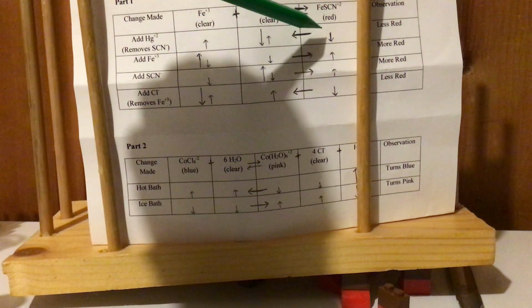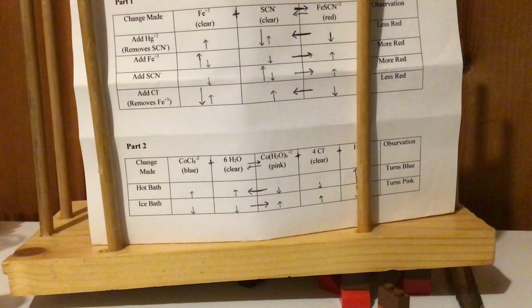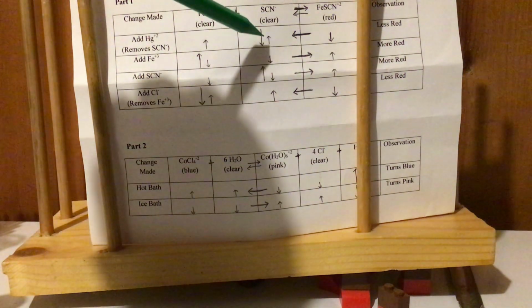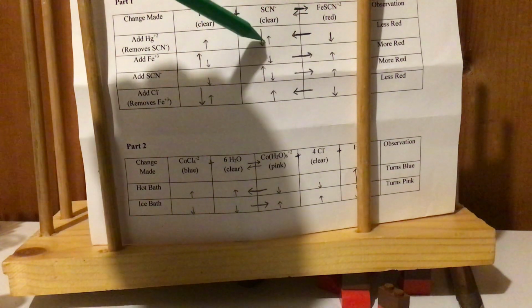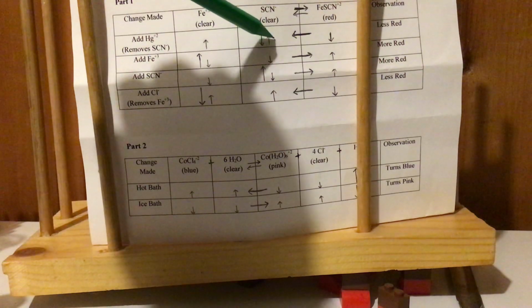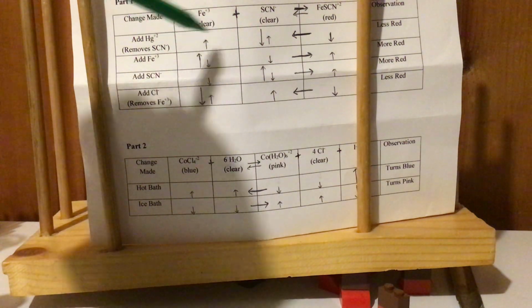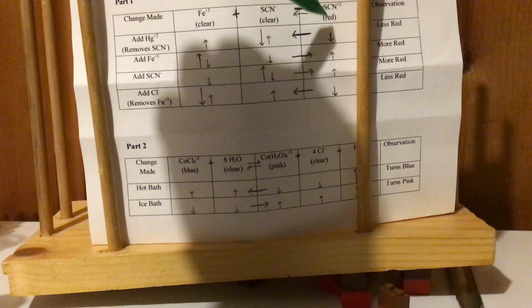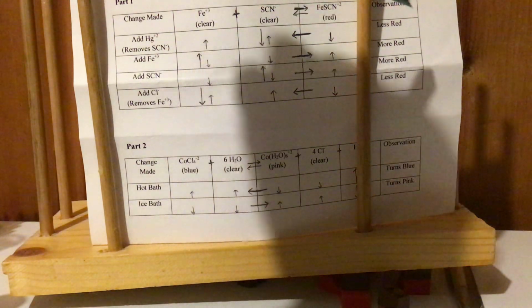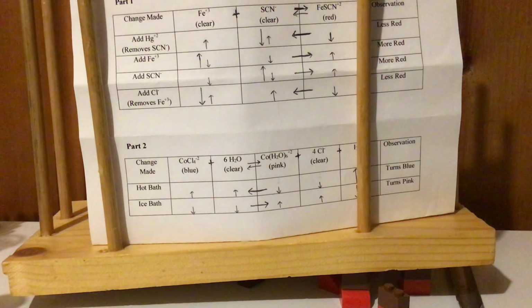The system would want to say, hey, I took something away. It's kind of like if, let's say, you had a fire in your house and you got insurance. You lost something, but you get compensated for that. Or somebody stole something from you and maybe insurance would cover it and you get some of that back. So if I take something away, the system shifts left, and what happens? The SCN increases and the Fe plus 3 increases, but the FeSCN decreases in that process. And if the FeSCN plus 2 decreases, then it's going to be getting less red.